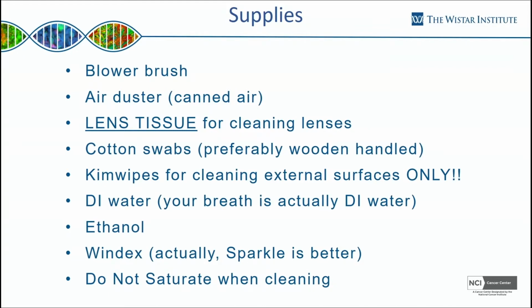You're going to use lens tissue only for cleaning lenses. So this is for when you go back and work with your own, not this one. DI water, or distilled water, works great, and your breath makes great DI water.